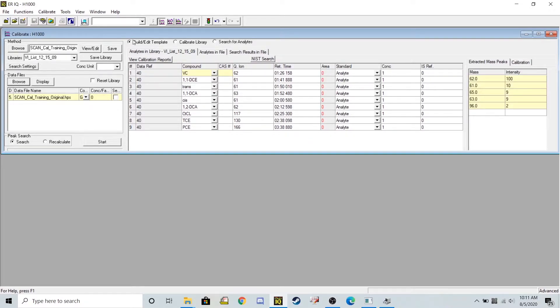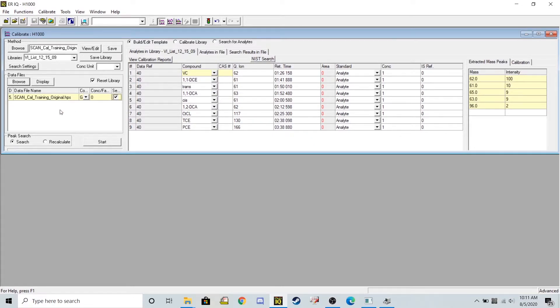So I'm going to click build edit template and then this reset library button right here and I'm going to select the original data file that should contain one of my chemicals of interest or whichever chemicals I want to quantify.